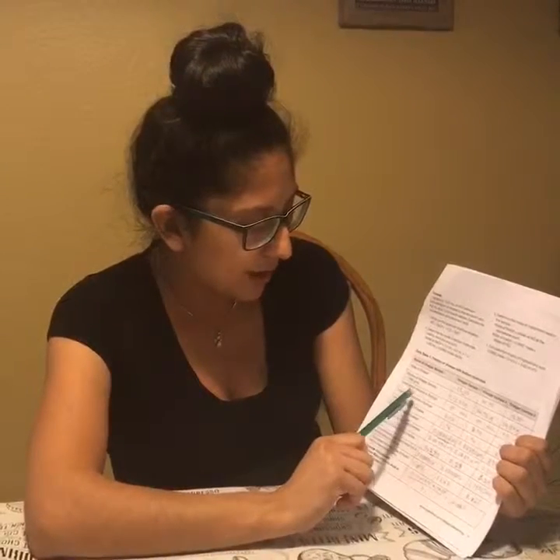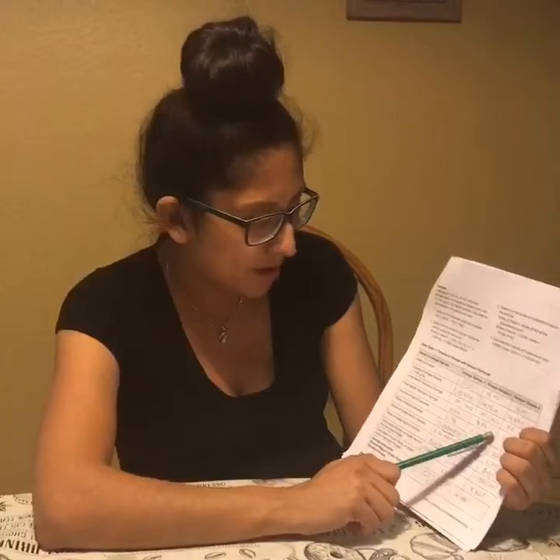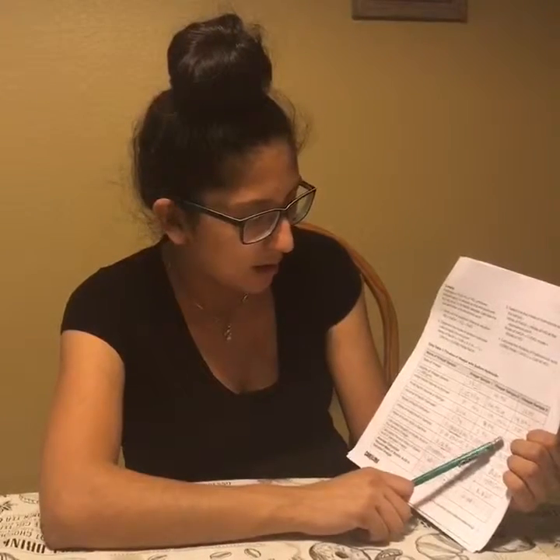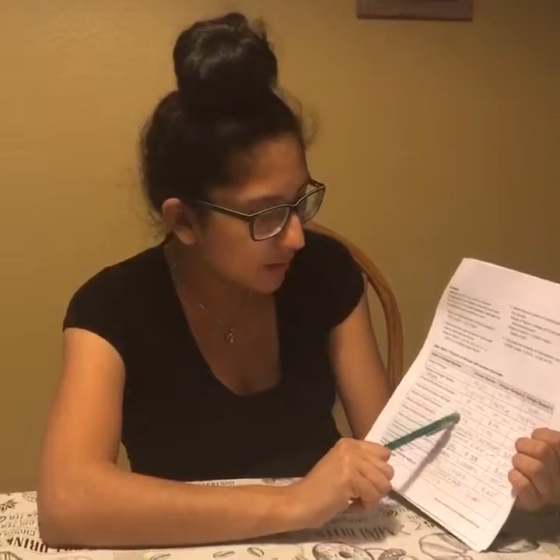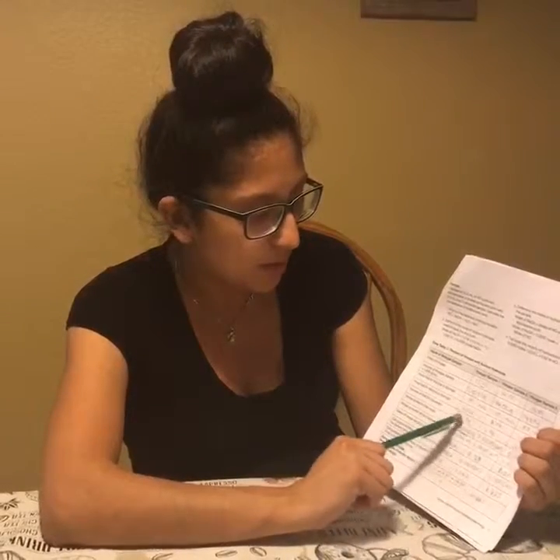The final volume in the syringe was different because it depended on how much color I was able to see, which determined how much sodium hydroxide I put in. The volume delivered was, like I said, almost the same, just a couple of numbers different, which was not that much. One was 3.94, one was 3.96, and one was 3.99. So very, very similar.